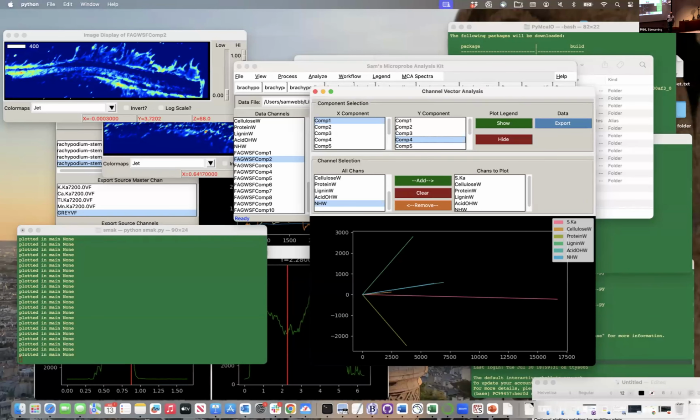Yeah, just to add a little bit, I think our bright fields and the confocals are quite different, so I'm not really sure if we will be able to fully take advantage. So what we did in one of the images, Sam showed, like when the hyphae, not with the root, but just the fungi, we simply used the fluorescent microscope to see if we were getting the area that Jocelyn and Sam were interested in analyzing.